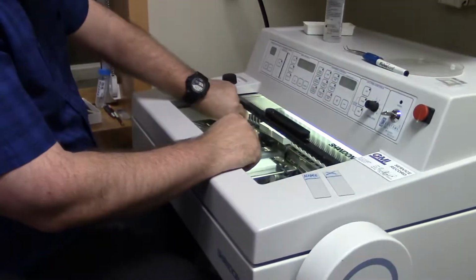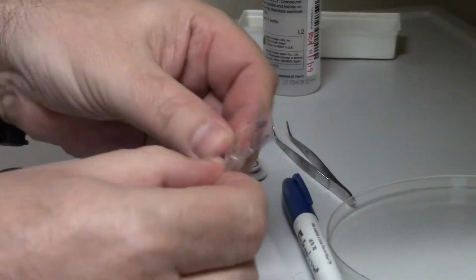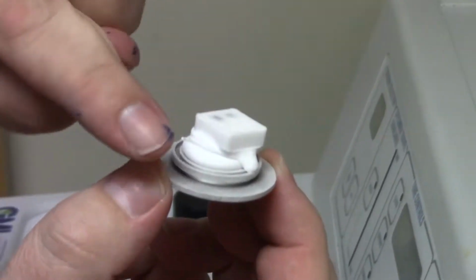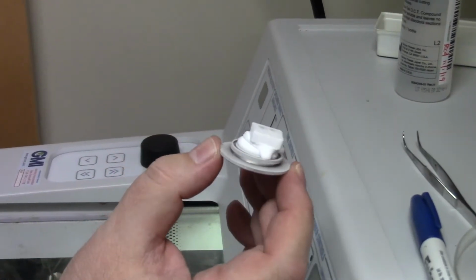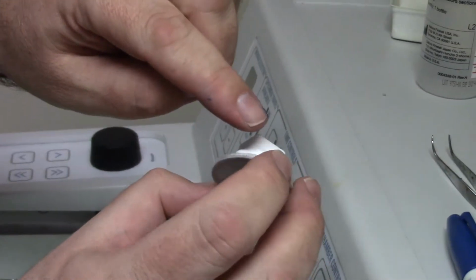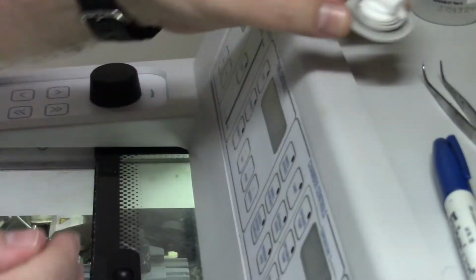I have gone ahead one step without you to make the sandwich. So there's my block of tissue. I just turned this upside down and popped it out. And I put it right onto my chuck that had a little mound of OCT, and I added a layer of peanut butter or jelly, whichever you prefer, to the middle to hold those two pieces of bread together. So here's my sandwich. But I noticed that some parts of the sandwich are sort of hanging over, and I want to make sure that when I start hitting this thing with a knife, no part of it topples over.